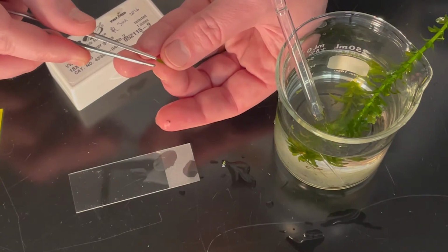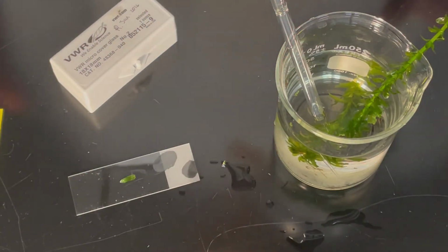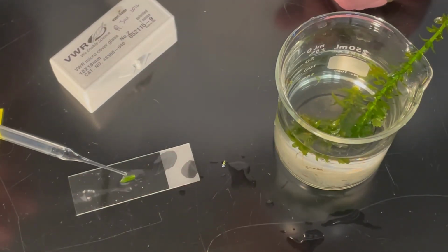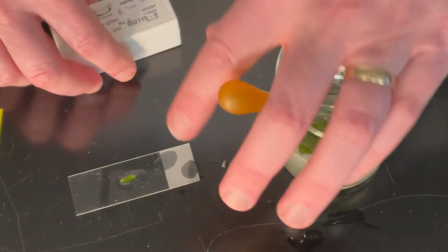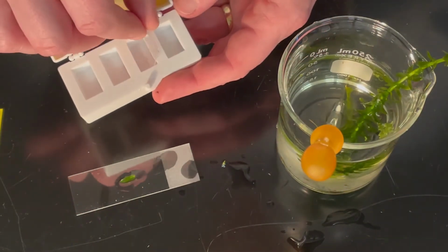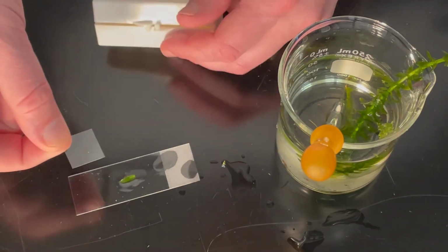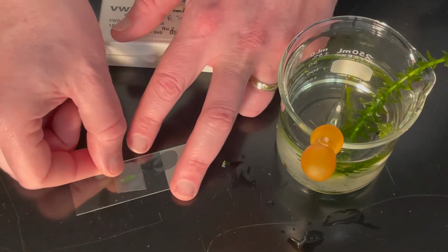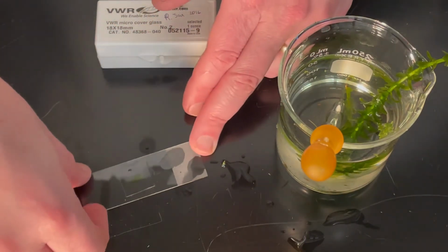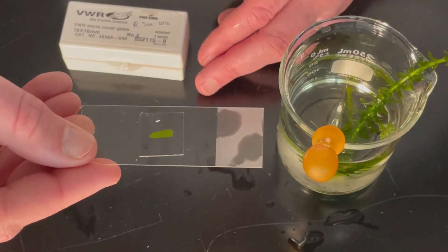Uh-oh. There we go. Okay. So this is a wet mount, so I need a little bit of water. I'll add a drop or 2 of water just to keep things fresh. And then the last thing we need is something called a cover slip. A cover slip basically looks like this. It's a small, skinny piece of glass that's just going to keep my specimen nice and flat and keep the water on it. And so there we go. I'm done making a wet mount.